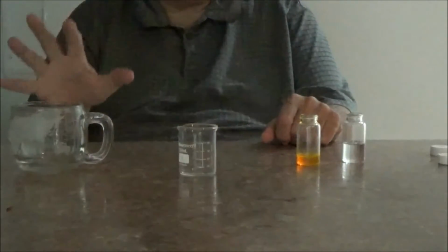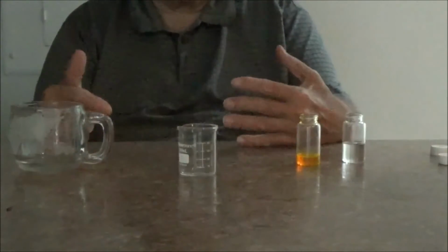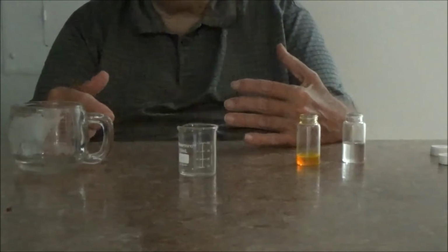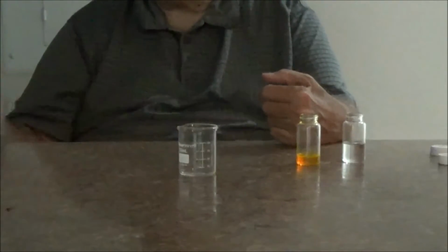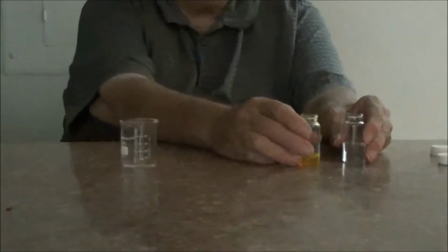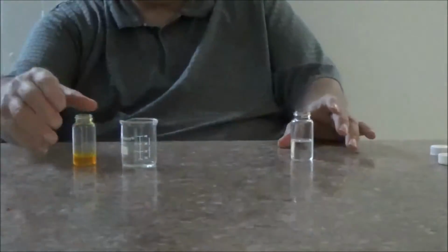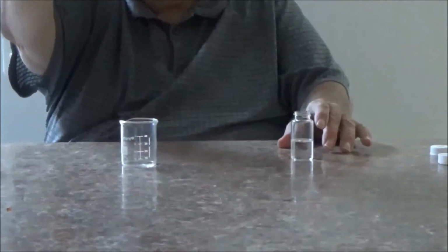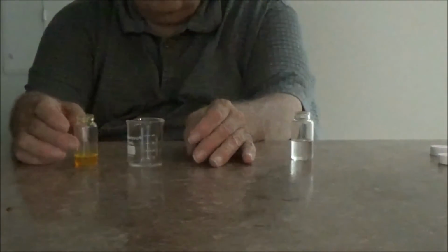Hello. We are now in a dim light situation where we are actually going to show you these chemoluminescent reactions. The first one I'm going to do is with a fluorescent dye right here that is kind of an orangey color. And so that you can see this better, I'll turn the lights on. It is a slightly fluorescent orange color, but it is giving out no light.